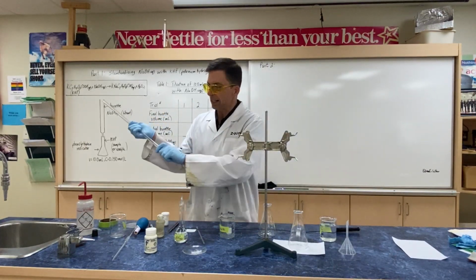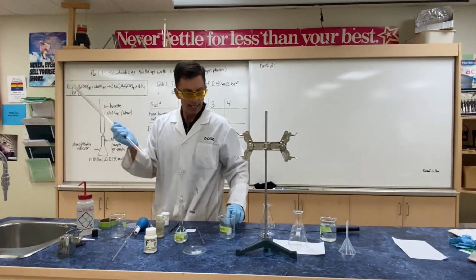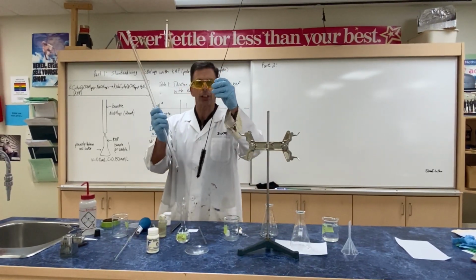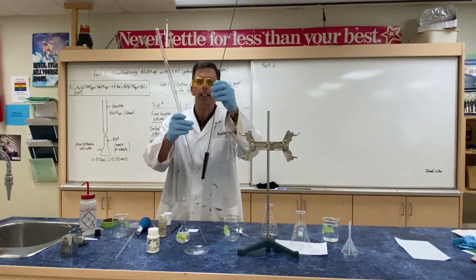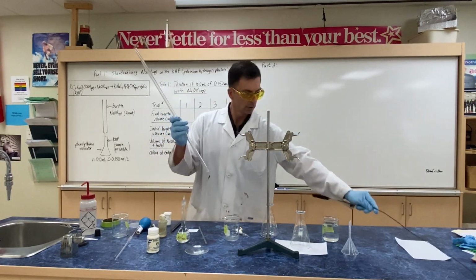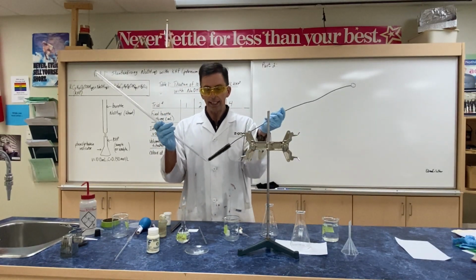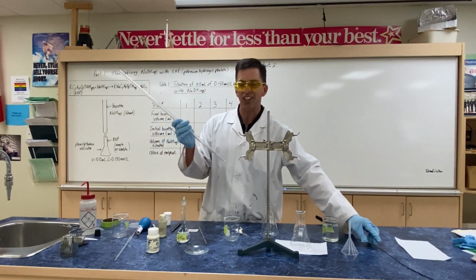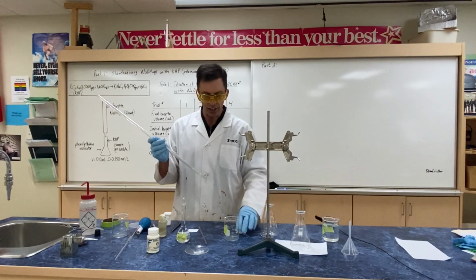we would take the burette and use this long-handled cleaning brush at a tall sink to thoroughly clean the burette. Why would we do that, Zdog? We want to clean out the burette to remove any contaminants. We only want our burette to contain our titrant.